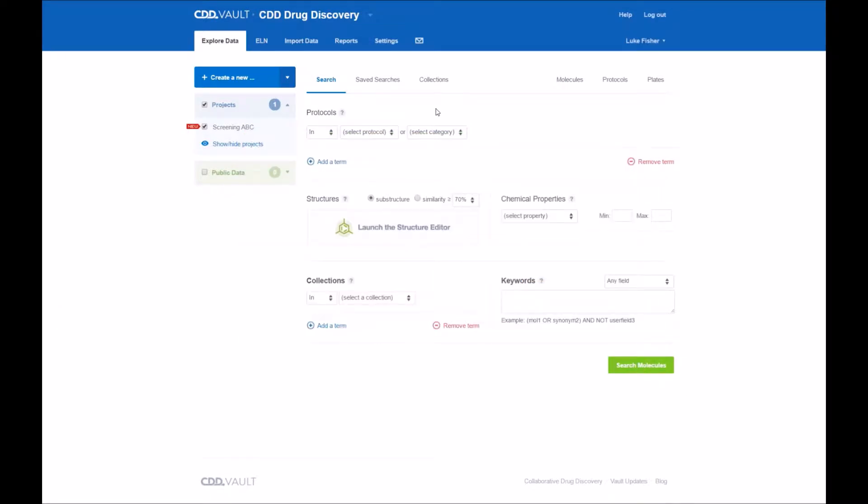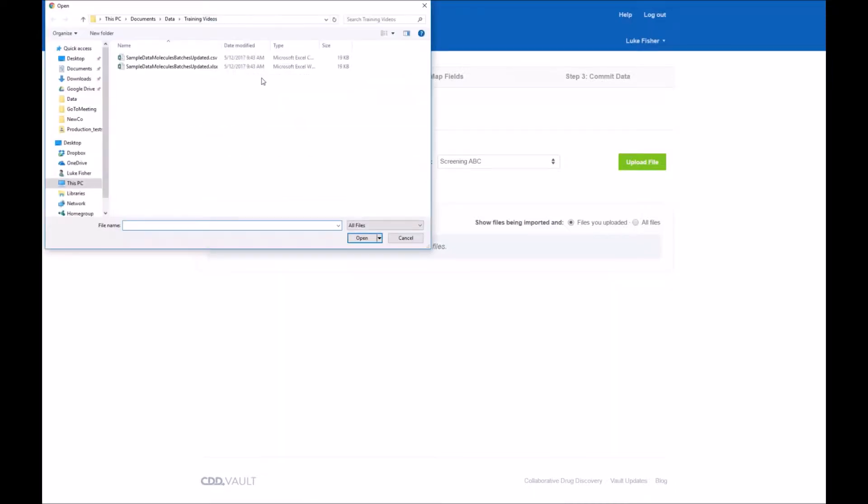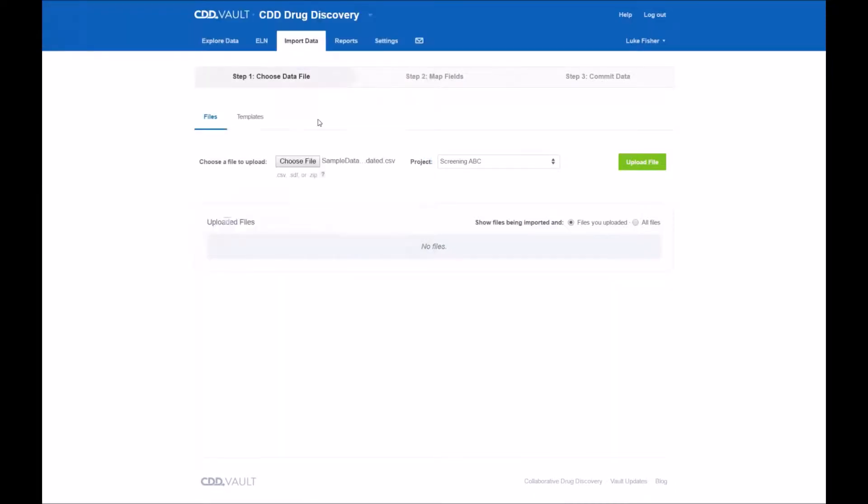Once you log into CDD Vault the operation is to start with the import data tab and choose a file, and again this is my data file here on my hard drive. Read it into whatever project you'd like. I just have a simple project name called Screening ABC.